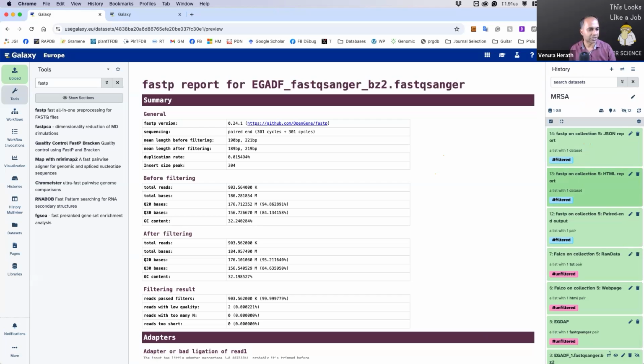Oh, okay. So Hasna, your question is what is the purpose of the JSON file? In molecular biology and this computing work, JSON is the format we use to feed other programs. This file is very comprehensive. It contains all the information, settings, and everything in a single file. That is very good for the documentation process as well, but it's not necessarily human readable. Therefore, most of the time we use it to archive everything we did rather than for visualization.